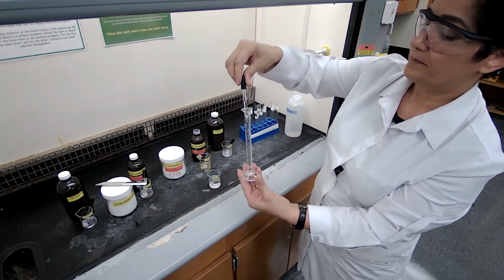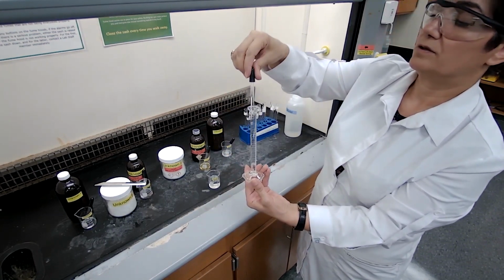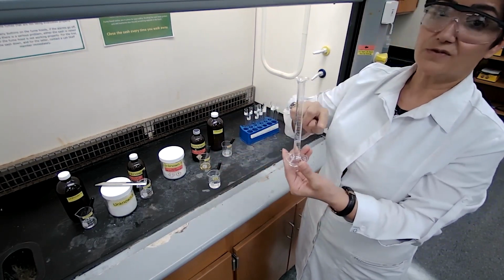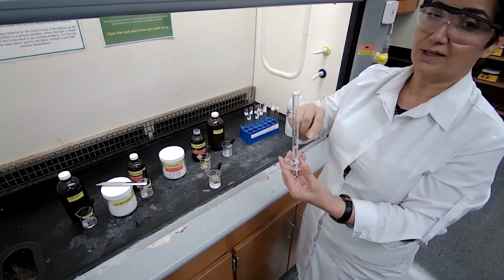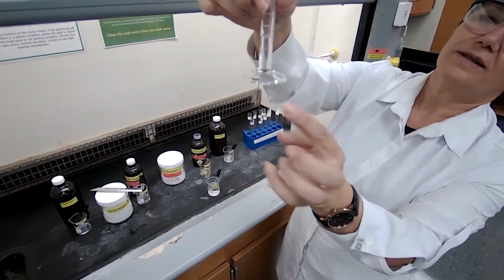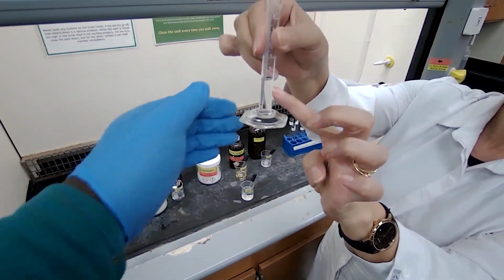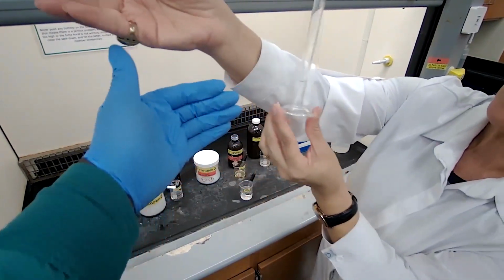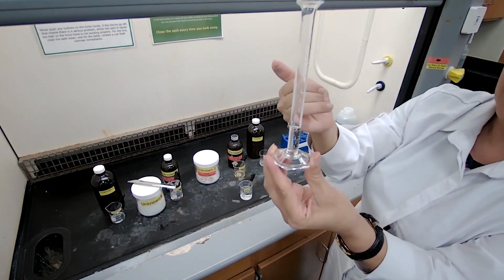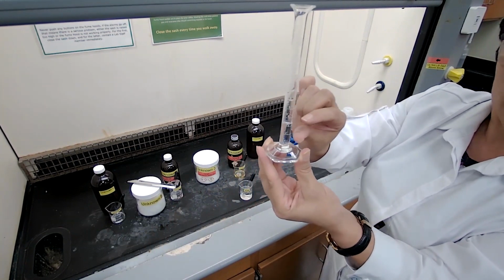1, 2, and 3. There is no reason for me to measure with the dropper and transfer to the graduated cylinder. I could have just transferred directly to the graduated cylinder. But this is to show you that if I get 3 full droppers, this is about 3 milliliters. You could see that 3 milliliters is a qualitative analysis. Again, it's not quantitative, and we are using a graduated cylinder, but it's about 3 milliliters.